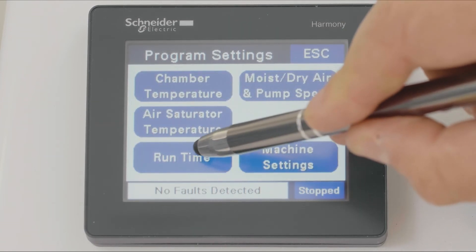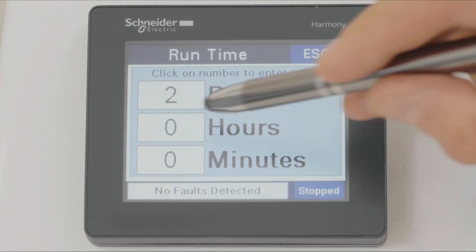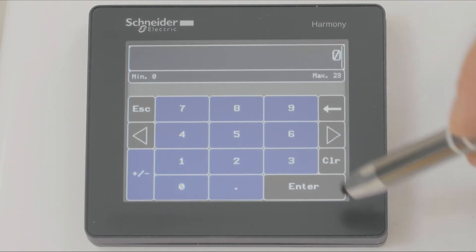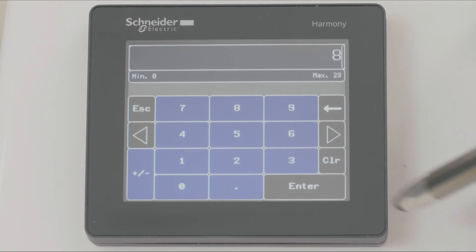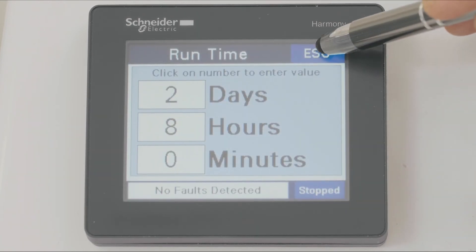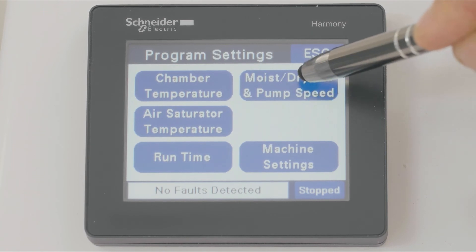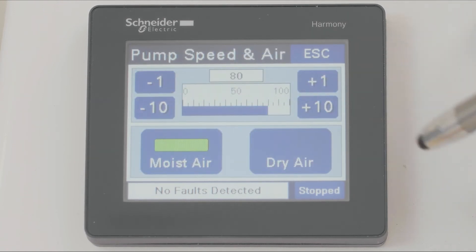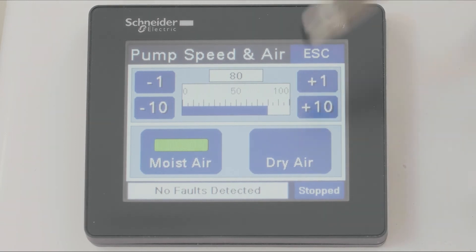We can set the run time for the chamber by opening a keypad, typing in the value and pressing enter. We can select between moist air and dry air, which is the difference between using the air saturator or spray, or not using the air saturator.